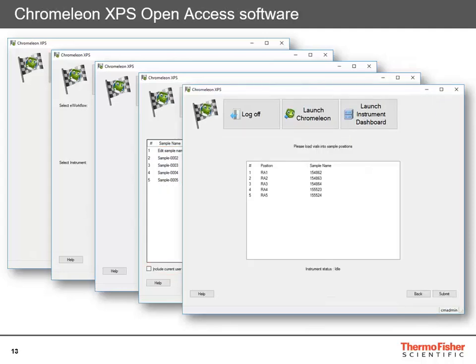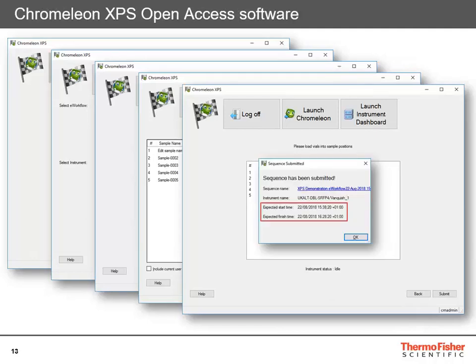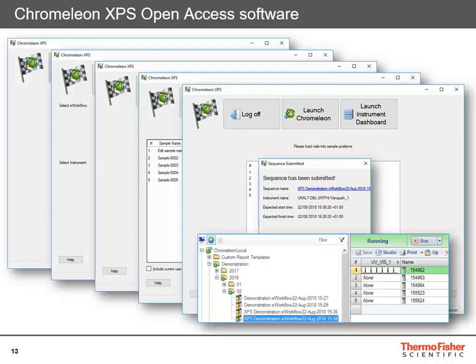Once done, click next and it prompts you to place samples in the specified positions on the autosampler. Click submit in the bottom right and it submits the sequence, telling you when it expects the sequence to start and finish. The sequence is then running in Chromelion immediately — you don't have to open Chromelion to do this. If set up to automatically export and notify you, you will get a notification when the sequence is finished and can go to the export folder to pick up the results.